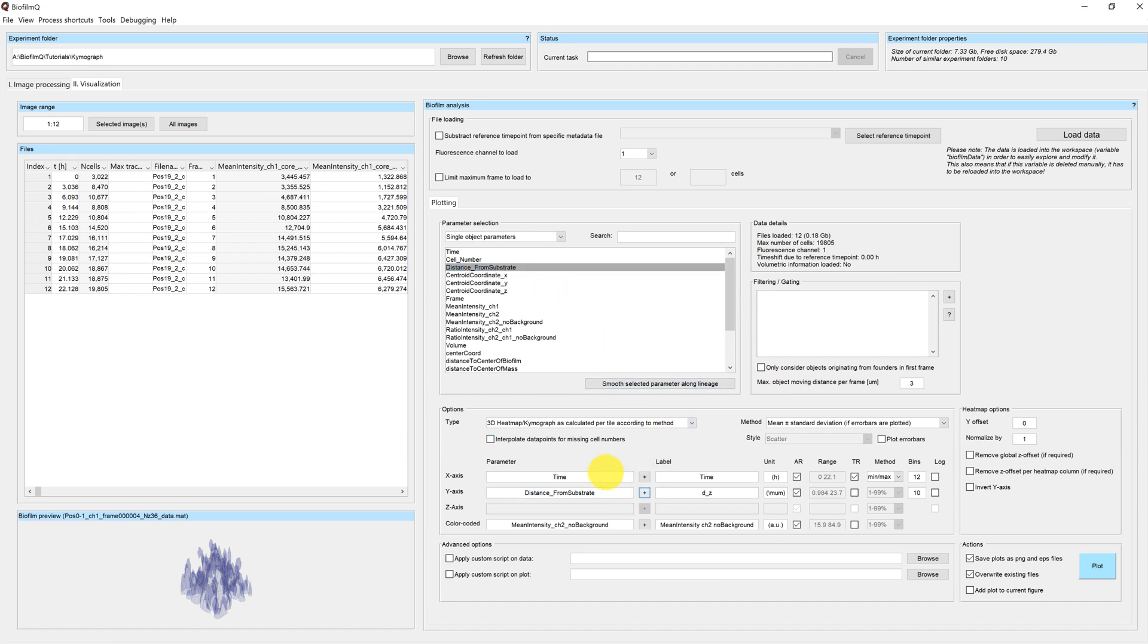You can pick these axes by selecting the different parameters in the table up here and then clicking on the little plus button next to the fields.